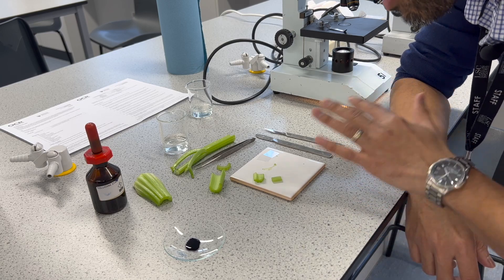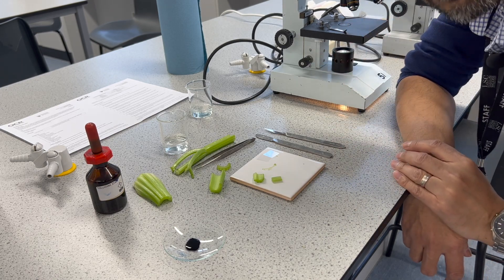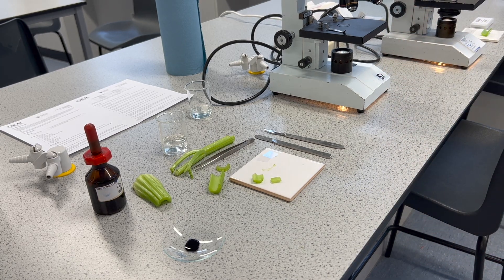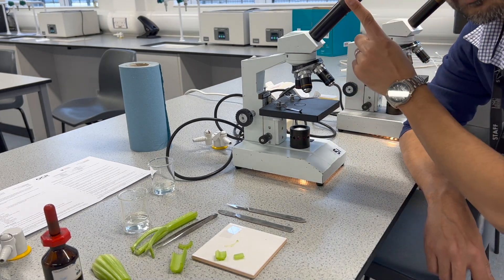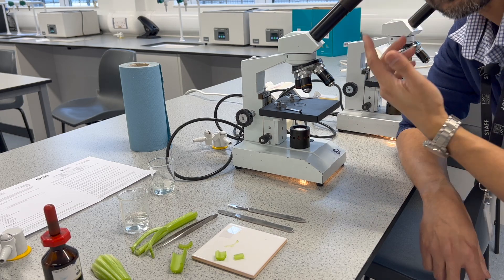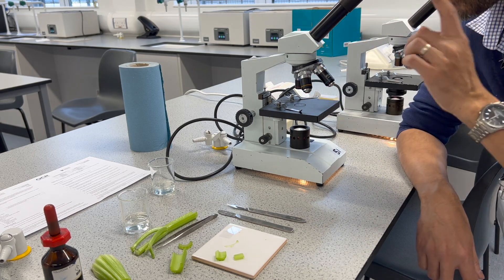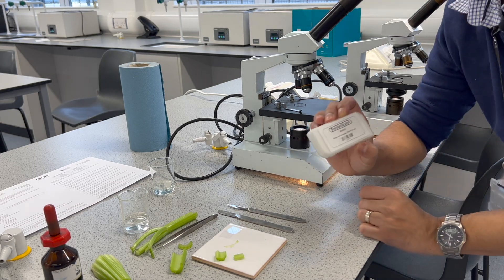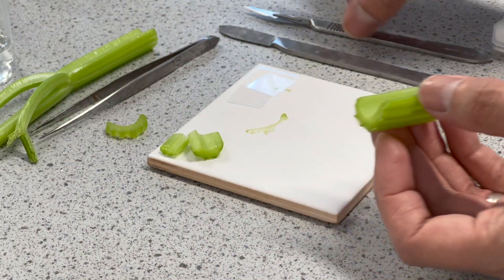Once we've made our slide, we also need to do some measurements using the eyepiece graticule, so we will need a microscope with an eyepiece graticule. When you look through it you should see a scale in your view, but by itself you cannot use it for measurements — you will also need a stage micrometer to calibrate.